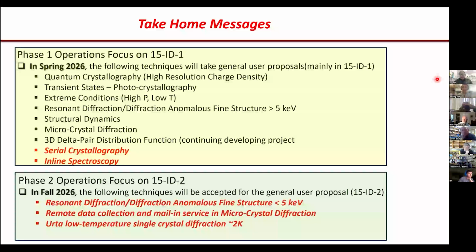But we can calibrate it using GSAS. Yeah, that will allow you to characterize your detector and that setup. Yes. The area detector, for our Pilatus, is 172 micron, too big. That's another issue. The new detector we have, Pilatus 4X, is 150 micron, still not comparable with the Eiger at 75 micron. That is a disadvantage of the detector at our end. But it's also 233 by 245 millimeters across, so you've got a much larger area, right? Pull it back.